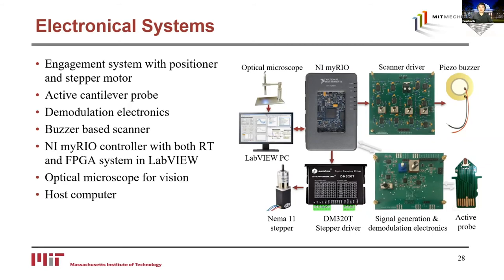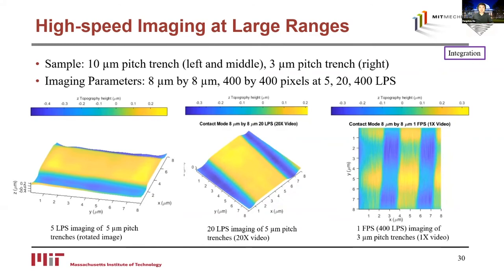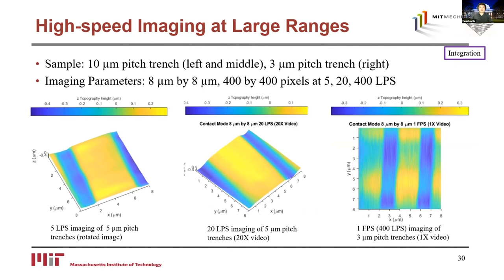The next example is the multi-layer stack scanner AFM, designed for high-speed imaging at a relatively larger range. A piezoresistive self-sensing probe with acoustic actuation is used with the multi-layer stack scanner. The color-coded CAD shows the probe and sample interface in blue, the full scanner assembly and coarse engagement systems in brown. We tested high-speed imaging at large ranges by imaging calibration gratings over 8×8 microns at 400×400 pixel resolution in contact mode at increasing scan speeds. The samples have 10-micron trench periods on the left and middle, and 3-micron trench periods on the right.